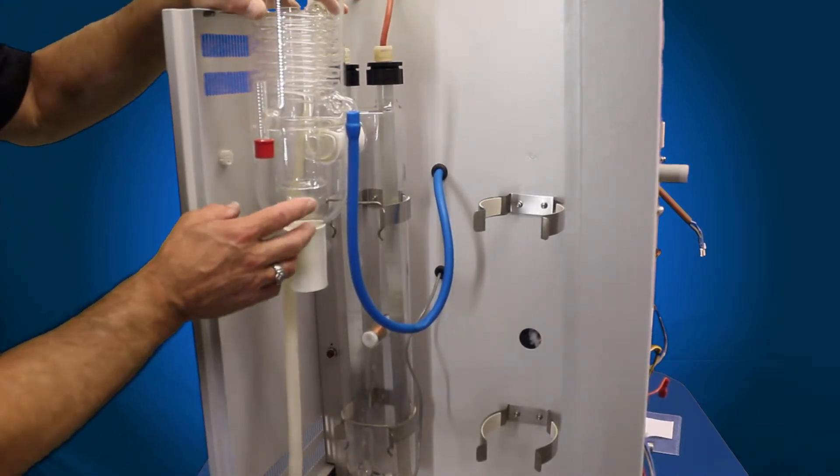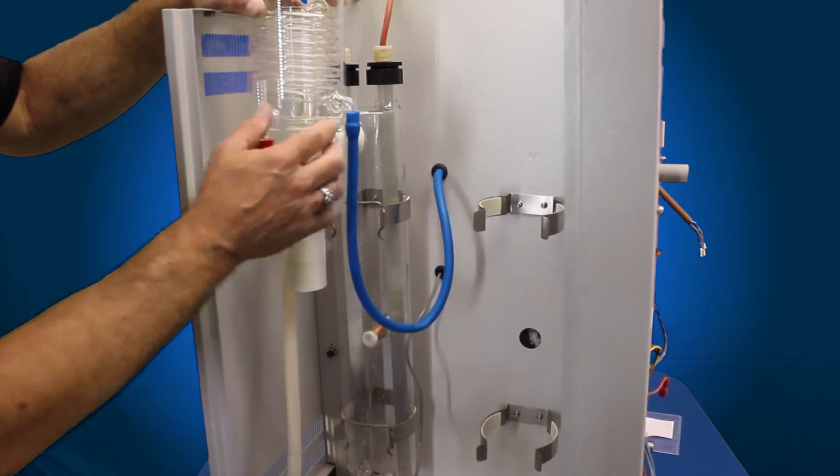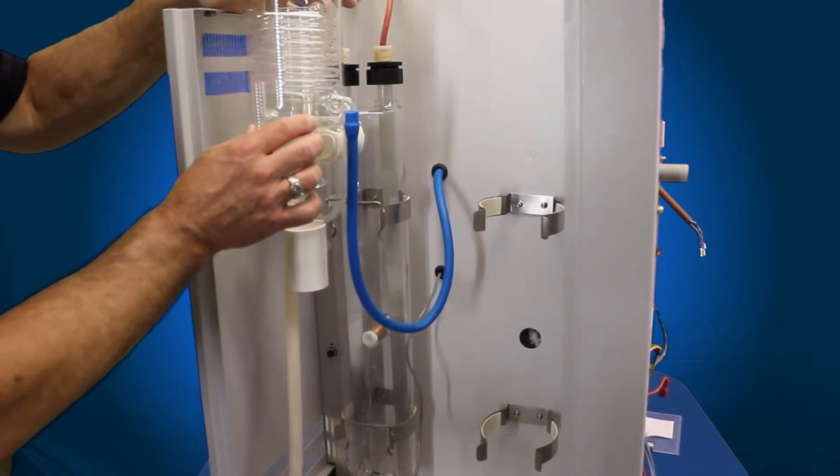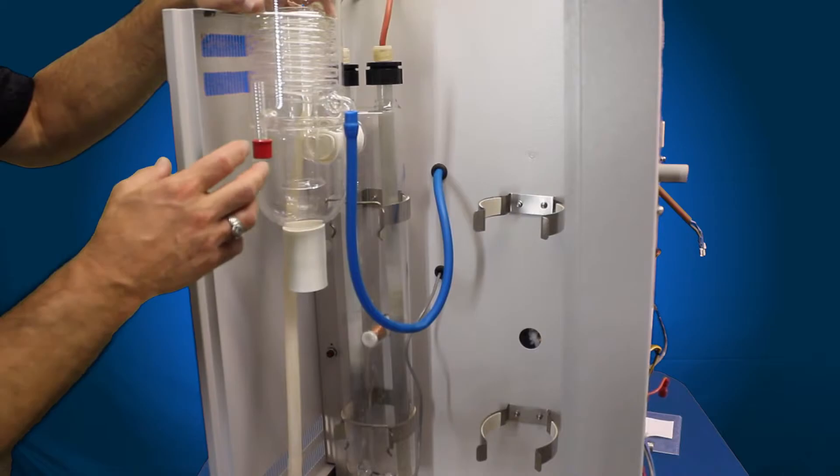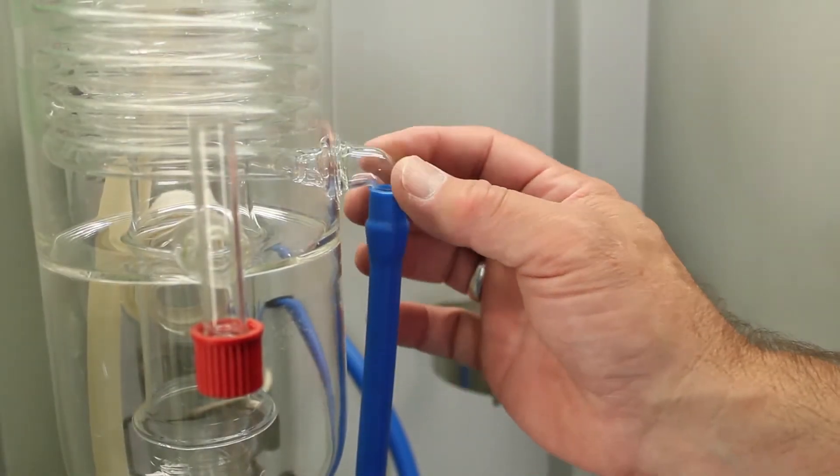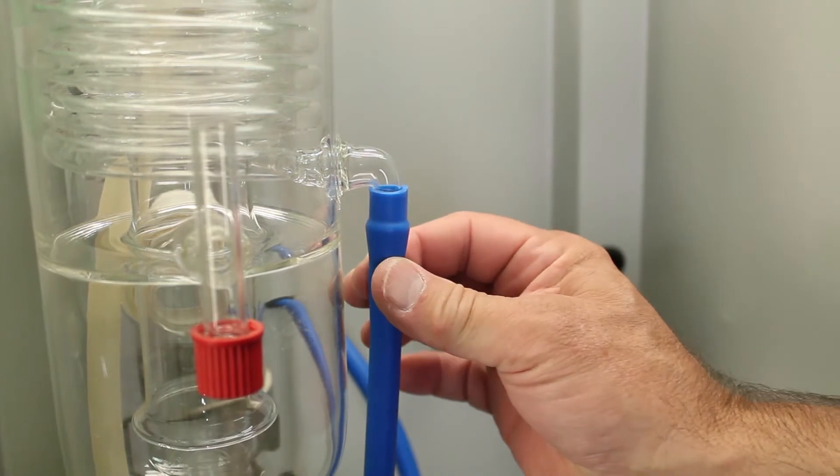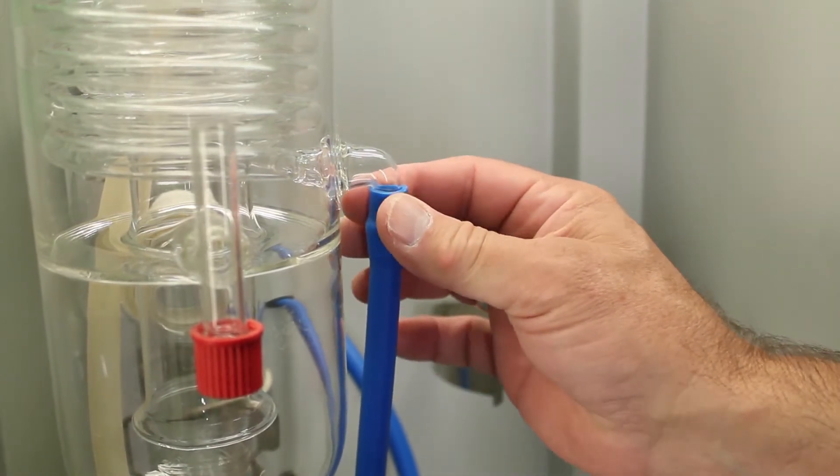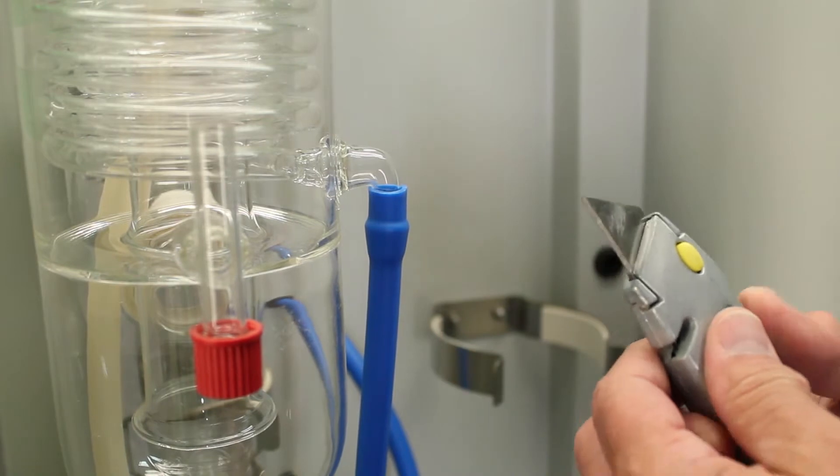And now we're going to go ahead and remove the tubing, your inlet tubing and your outlet tubing to the condenser, and then we'll slide the condenser away from the boiler. Now, tubing is typically adhered to the glass components because it's a silicone tube. The heat will adhere it, so you won't be able to get the tube off once it's on there for any length of time.